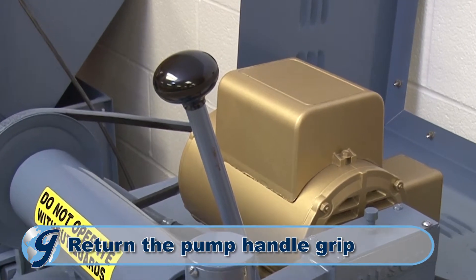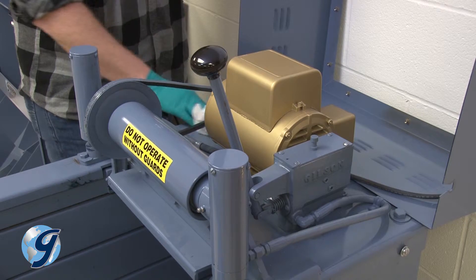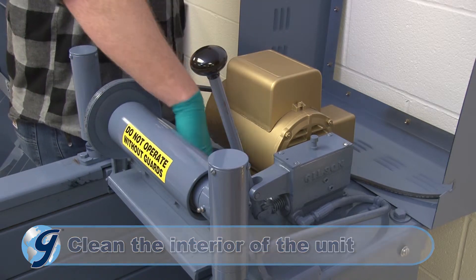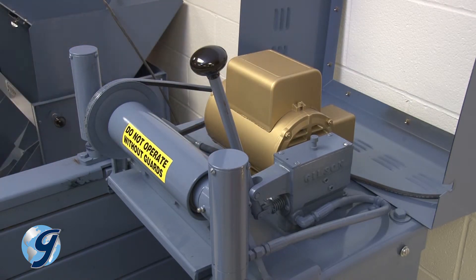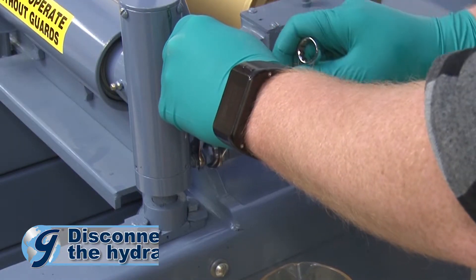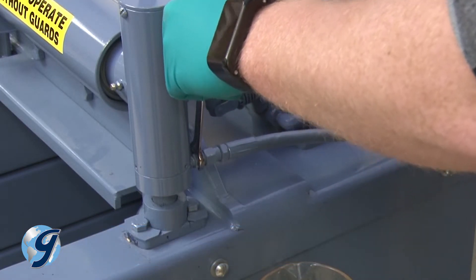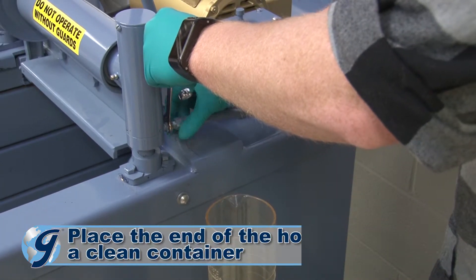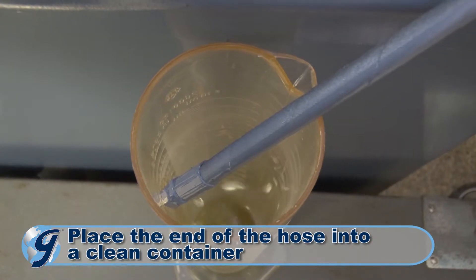Now, return the pump handle grip to the pump handle. Next, clean the interior of the unit to prevent foreign material from falling into the pump and contaminating the oil later. Disconnect the hose from one of the hydraulic cylinders, leaving the other end of the hose connected to the pump. Place the free end of the hose into a clean container at a level that will allow gravity to empty the system of oil.